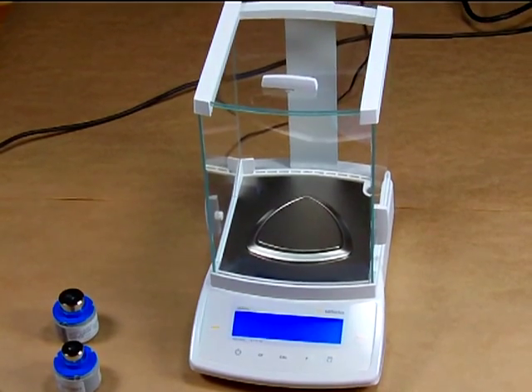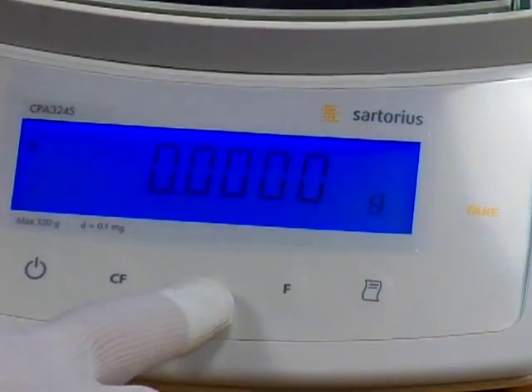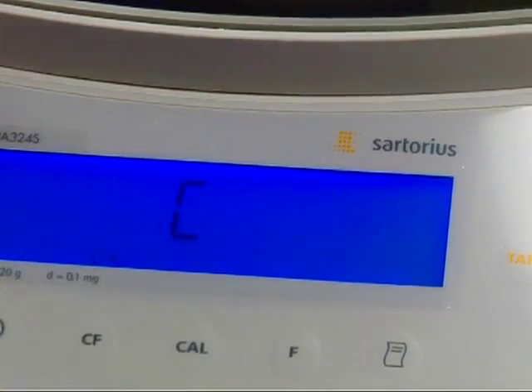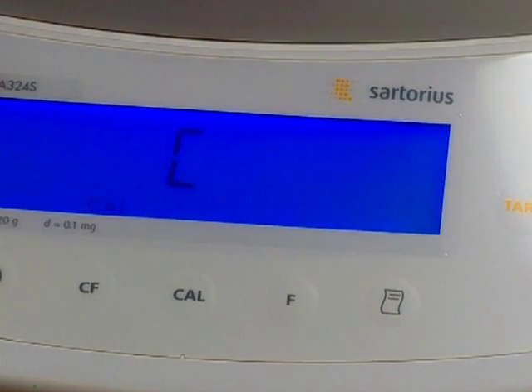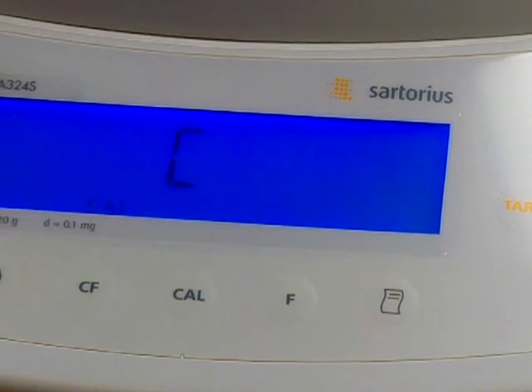First we'll power up our Sartorius CPA324S. It does the power-up sequence. Out of the box, the default is internal calibration. So if we press the Cal button, the balance lowers the internal calibration weight and we'll see C, then CC to confirm it's storing the value. At the end of the calibration, it displays a number — the delta, or difference from the last time the balance was calibrated.